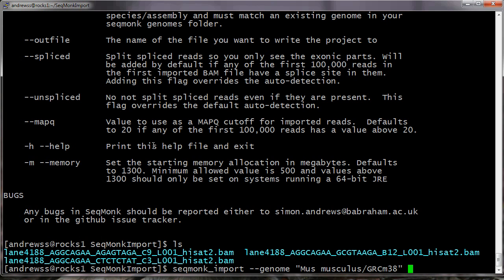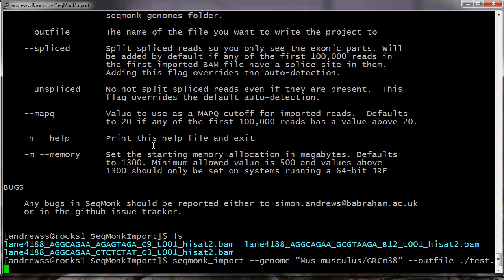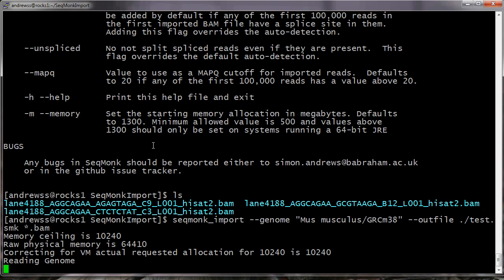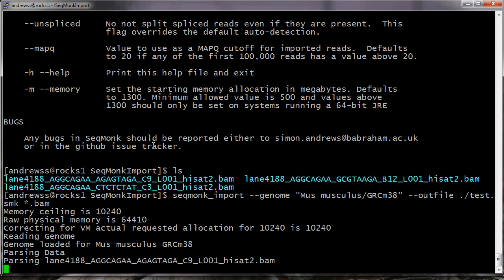My output file is going to just be called test.smk and then I'm going to import all the BAM files, so I'll just do *.bam. OK, that will now start up a non-interactive session and start parsing my data files. I'll trim the video at this point so you don't just sit and watch it importing for ages, but I'll just let that complete.